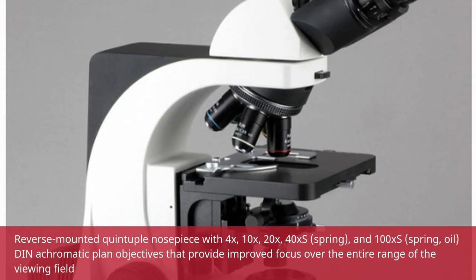The Reverse Mounted Quintuple Nosepiece includes 4X, 10X, 20X, 40XS Spring, and 100XS Spring Oil DIN Achromatic Plan Objectives that provide improved focus over the entire range of the viewing field.